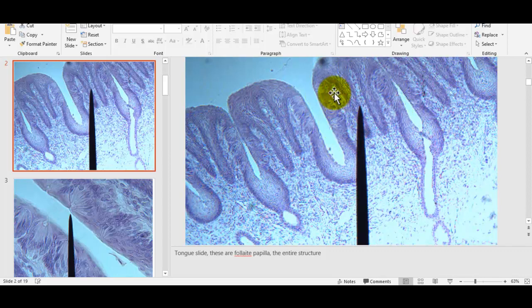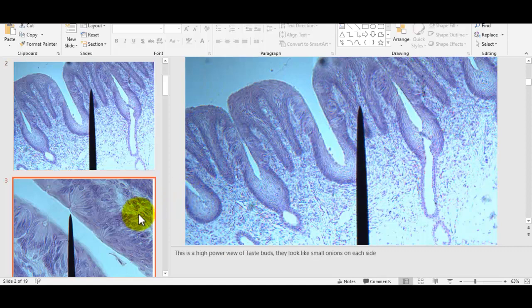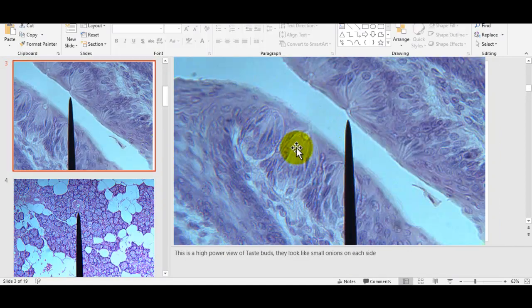And then on the inside, where they come down this way, on the very inside parts of these, if you blow that up bigger, you get these little circular structures that I think look like onions. Those are taste buds, and that's the opening here. So saliva mixes with food, and then it goes down into there. And like I said, the tongue is responsible for sour, bitter. The other two are escaping me at the moment. But all the different varieties of how a person can taste something.